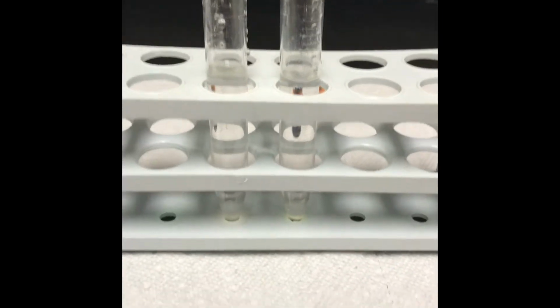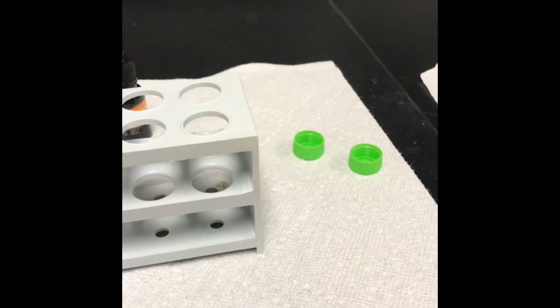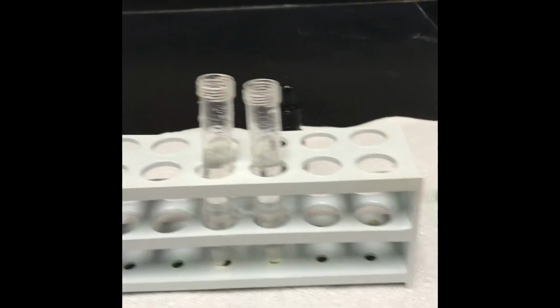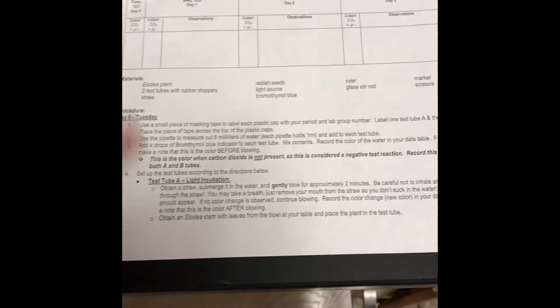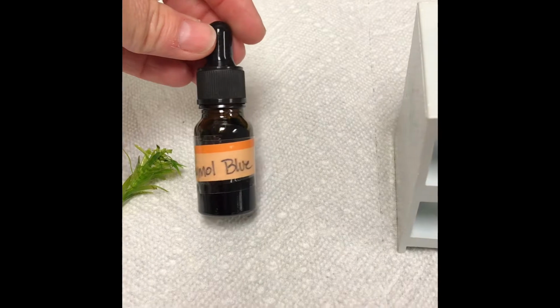Okay, so I have already set up, ready to go. Here are my 2 tubes, and this is just 8 milliliters of water that I have prepared, and one of these is going to be my tube A, one is tube B. So what we have to do to both tubes, and I'm following the instructions that are down here on the bottom, make sure that you've read through these, please. We're going to add 4 drops of a chemical indicator called bromothymol blue.